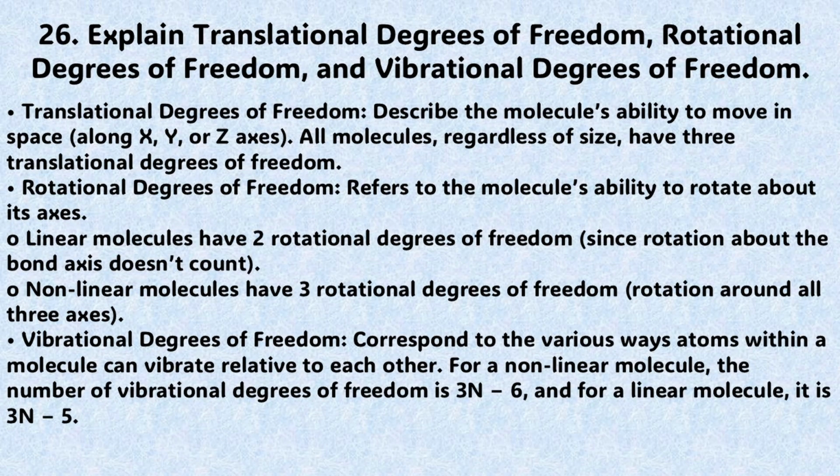Now we will move to question number 26. Explain translational degrees of freedom, rotational degrees of freedom, and vibrational degrees of freedom. The answer to this question is very simple. Translational degrees of freedom describe the molecule's ability to move in space along x, y, or z axis. All molecules, regardless of size, have 3 translational degrees of freedom.